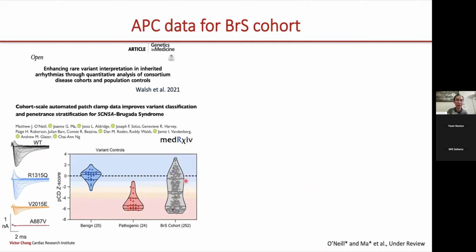So we found that a large proportion, roughly in this case half and half, have normal and abnormal function, and you can have wild-type like function, partial and severe loss of function. And remember, these are detected from patients, but for Brugada syndrome, it's a bit tricky, because we don't really know sometimes whether SCN5A is really the cause or not. But it tends to be believed that if you have an SCN5A variant detected in a Brugada patient, most likely it is, but we found 40% or 50% have a normal function in our assay.